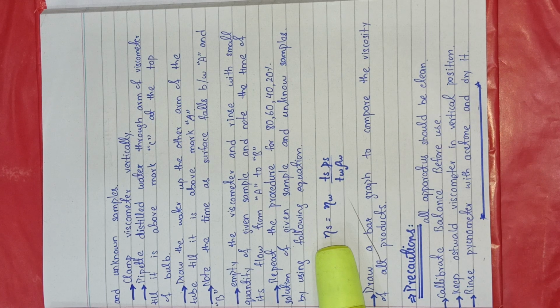So now you note the time the surface takes to fall between A and B. The surface of the liquid which you filled, when it reaches the mark A, you will start the stopwatch and find out the time it takes to move from mark A to mark B. Now you empty your viscometer, rinse it with a small quantity of the given sample, and note the time of flow from A to B. So first you performed this experiment with water, with distilled water. Now you will do it with the sample you need, the pharmaceutical product whose viscosity is to be determined.